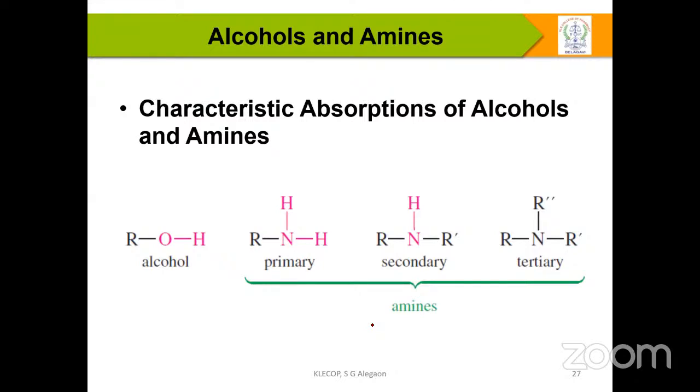It is easy to understand for amines and alcohols, but understand very carefully: whenever you perform any reaction, whether in your final compound or the starting compound, you may have internal and external hydrogen bonds, and how this changes when you get the final product.